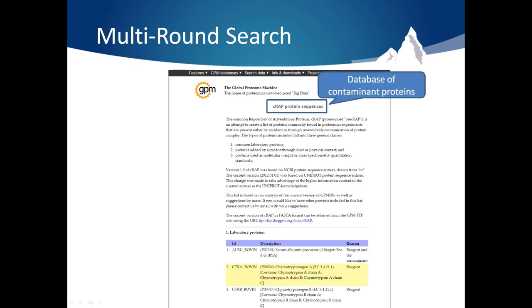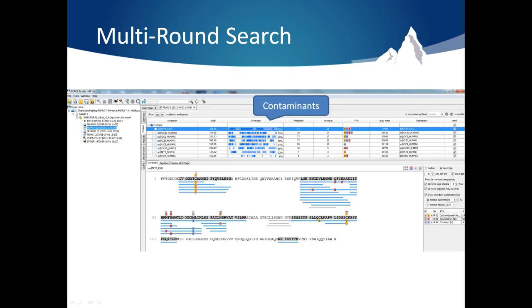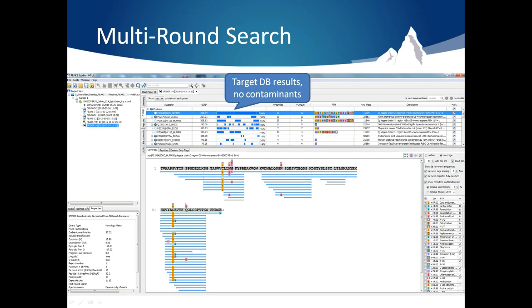One of the best applications for this new search type is filtering out contaminant proteins. For example, you can download a contaminant database like CRAP shown here. First, do a search with the contaminant database. Here you can see we are able to identify a few contaminants in this dataset. These scans will be removed from the Multi-Round Search. Then, when you search your target database, this will give you a list of protein identifications without contaminants.